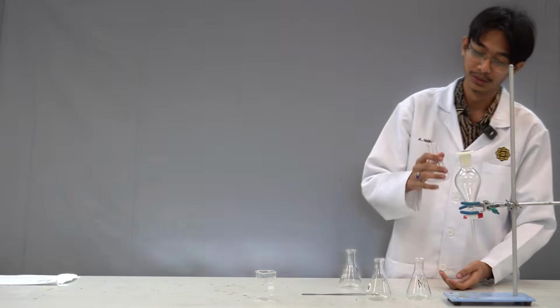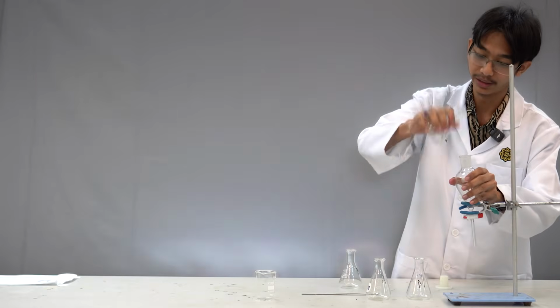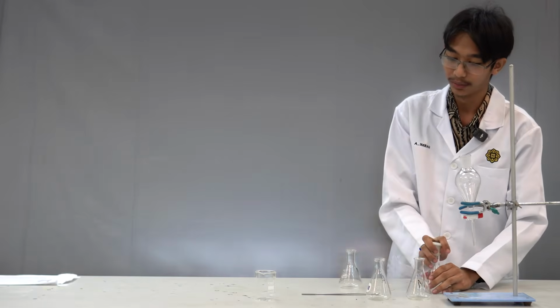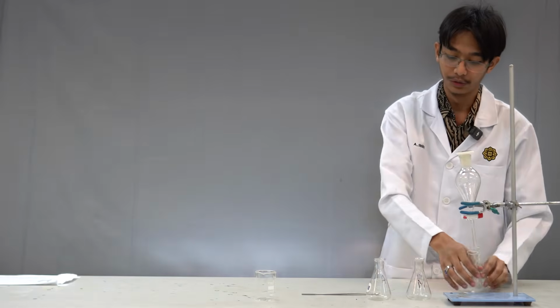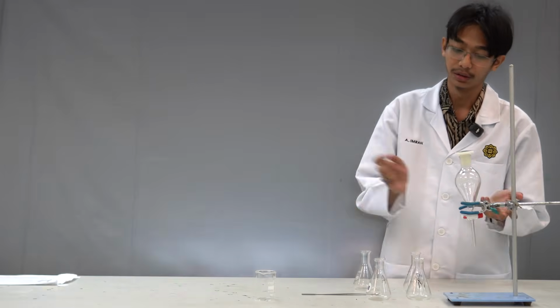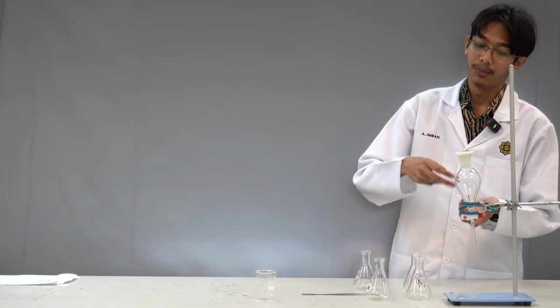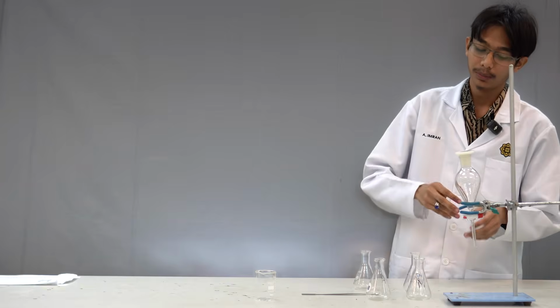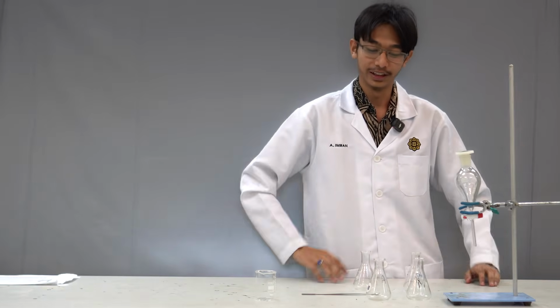Of course, it's going to be a no. So basically, you're just going to put it again, get it inside, and then you repeat the same steps again. You add your base, then you just filter both, and then you're done. So basically, you just do it as many times as you can. But as we did in class, we basically just did it like 2 times. But you all get the idea, right?